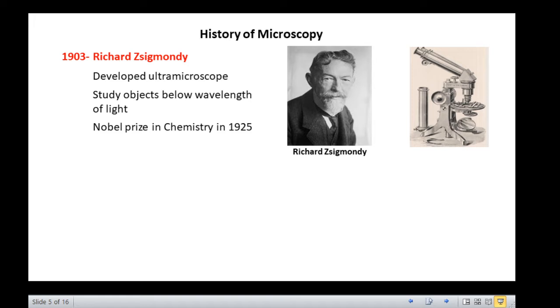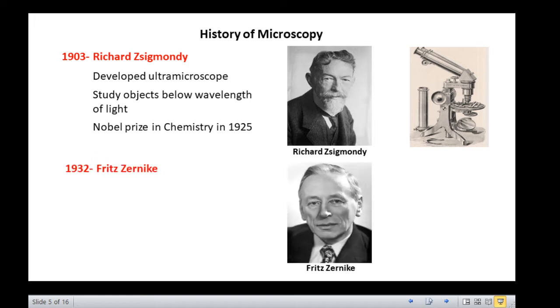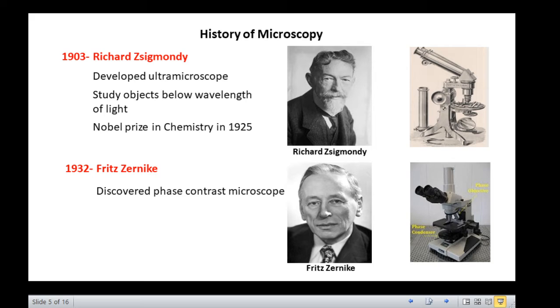In 1932, Dutch physicist Frits Zernike discovered that he could view unstained cells using the phase angle of rays. He went on to discover the phase contrast microscope, which allowed one to see colorless and transparent biological materials at a microscopic level. This brand new frontier of microscopy allowed scientists to view cells without staining them in order to view internal cell structure.